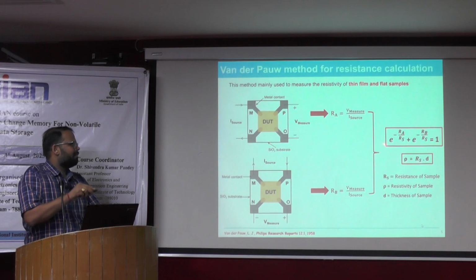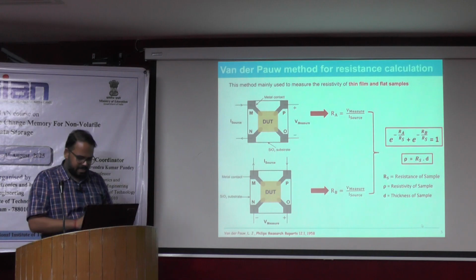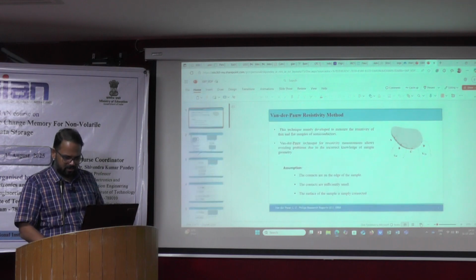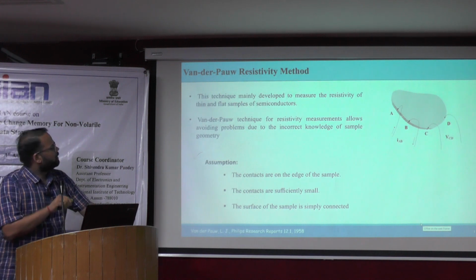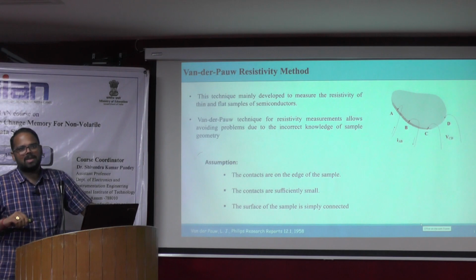But how did they propose this? To get more idea about this, you can refer to this paper, and I can also give you a brief idea of what this method is and how it works. You can see here, this method was mainly developed in this report to measure the resistivity of thin and flat samples of semiconductors.